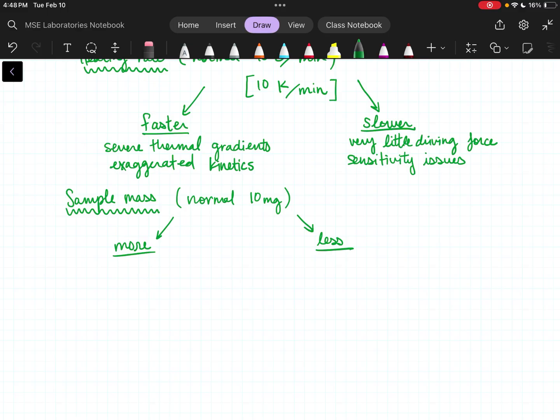So if I have a glacier, thermal gradients. The outside of the glacier maybe is evaporating in the sun, and the inside is super duper cold. So we've got these thermal gradients through the glacier. Even if it gets really hot on the outside, the middle is never going to react until the whole outside has melted down.